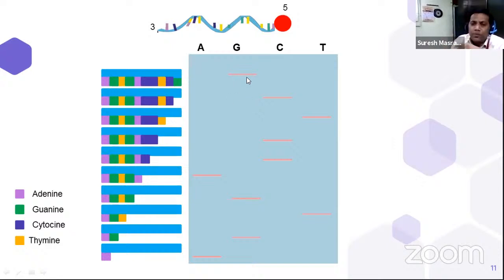Now, from top to the bottom, these different positions of the DNA fragments, or bands, indicate the molecular weight or length of the DNA. Thus, the lighter DNA runs very fast, and thus it manages to reach the opposite pole.